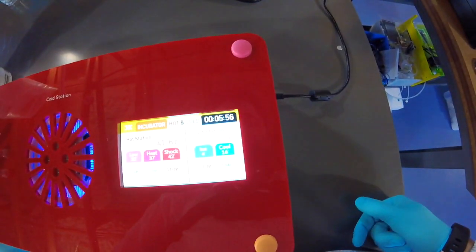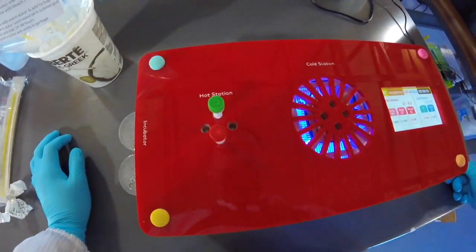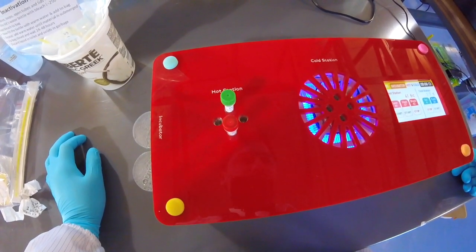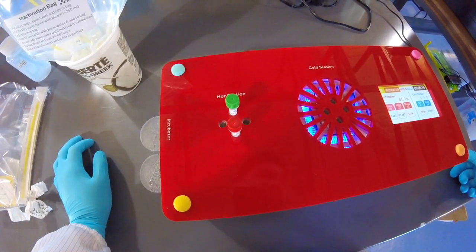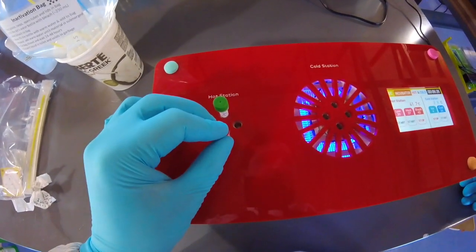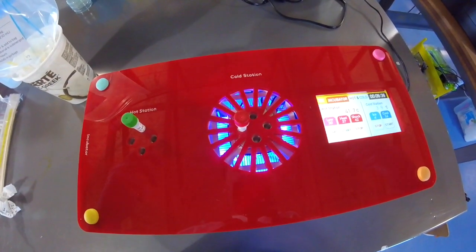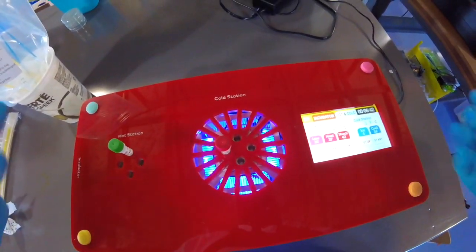All right. We're at 6 minutes. 6:21, 6:22, okay, we got to get ready to shift back here. 25, 26, 27, okay. All right, we shift back onto the cold station. Now the cells are cooling down. Again, the lipids are cooling down, making the membrane more rigid. The DNA is trapped inside the cells. And so we're just going to let this cool for 2 minutes.